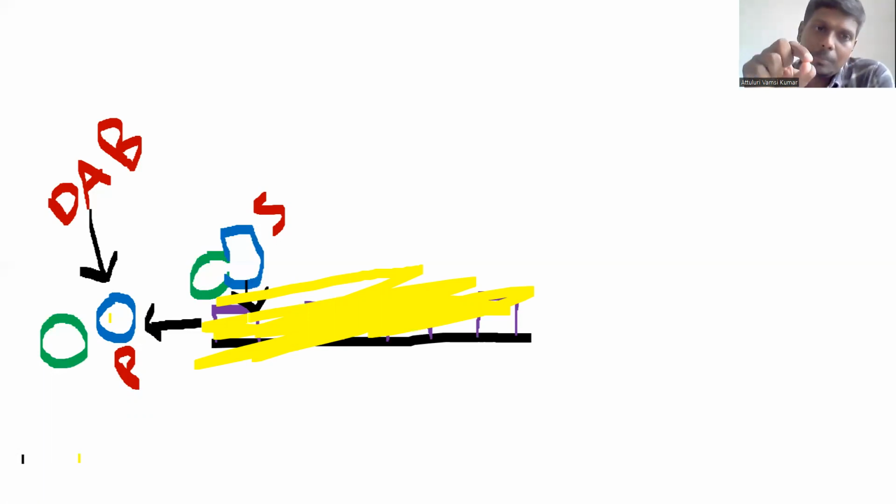How many enzyme molecules are present in the tissue? That number of molecules can be detected by the intensity of the color developed upon adding the substrate. The higher the color, the more enzymes present in the tissue. So the intensity of the color developed gives us the quantity of the enzyme, whereas the development of color itself indicates the presence of enzyme within the tissue.